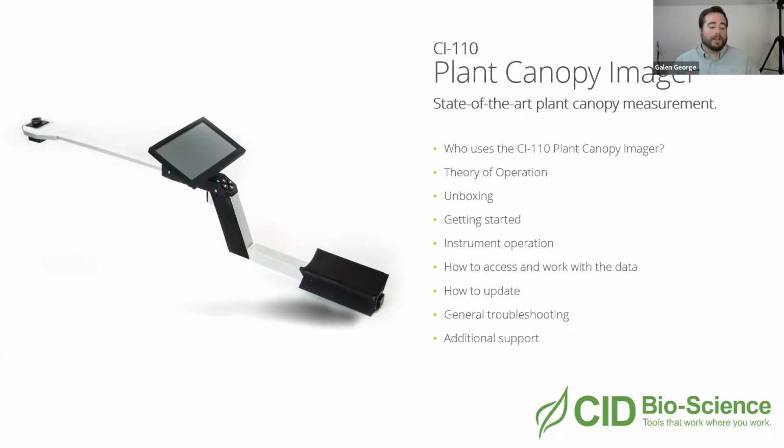Now the theory behind this is essentially we're taking a photograph, and it's a hemispherical photograph from the ground up of the canopy. And we're taking that photo and we're turning it into a grayscale image. And that grayscale image then has varying levels or degrees of grayness throughout that entire image. And there's a method, what we call the gap fraction method. And what it's doing is assigning a threshold value on that grayscale image, on that histogram of grayness, those different varying levels of grayness. It's establishing a threshold value that will determine what is sky and what is plant.